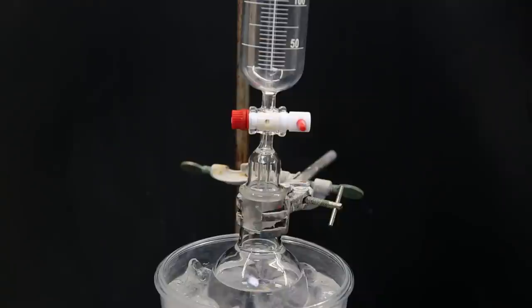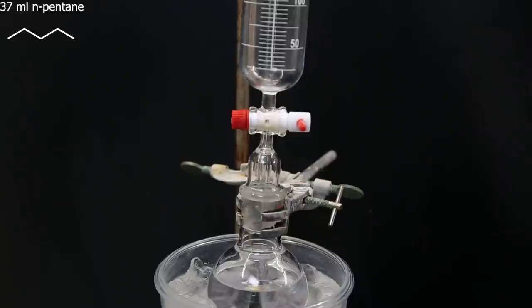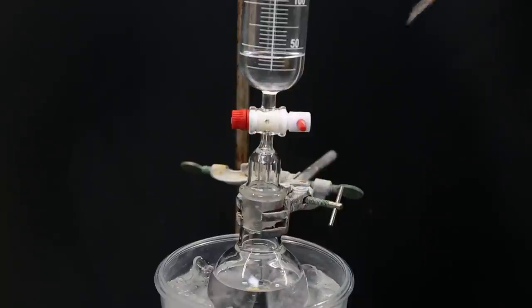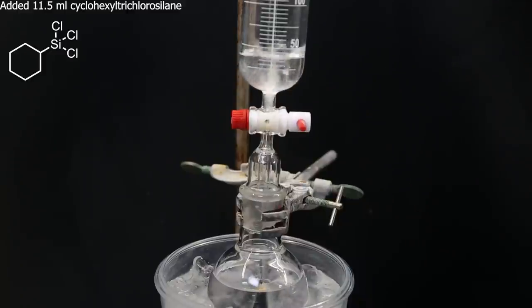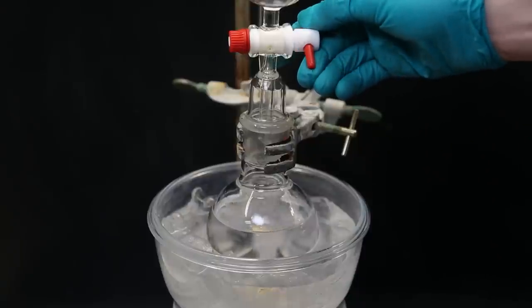Now I attach a dropping funnel, and into the dropping funnel, I first add 37 mL of pentane, which will dilute the second reactant, so that the reaction doesn't proceed too vigorously, and the addition can be better regulated. Now to the pentane in the dropping funnel, I add 11.5 mL of cyclohexyltrichlorosilane, which is the second reactant for this reaction. I stopper the funnel, and then slowly start adding in the reagent from the dropping funnel.